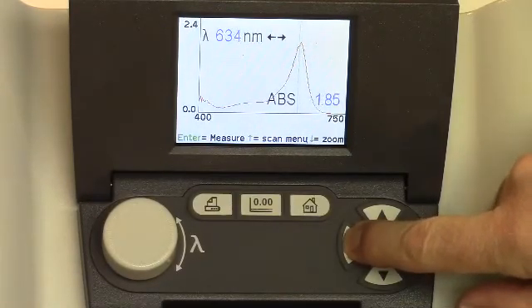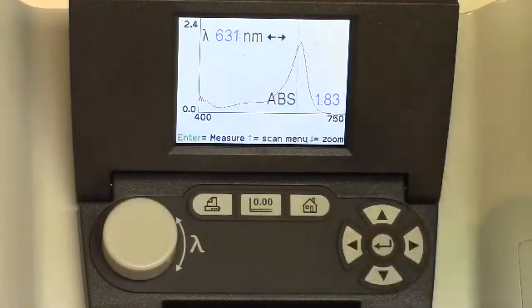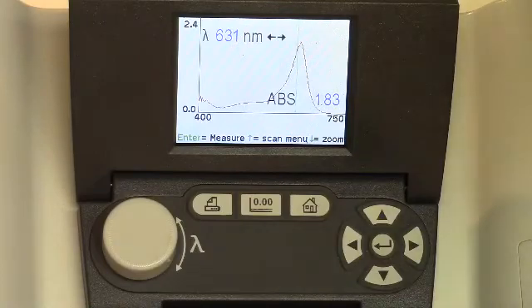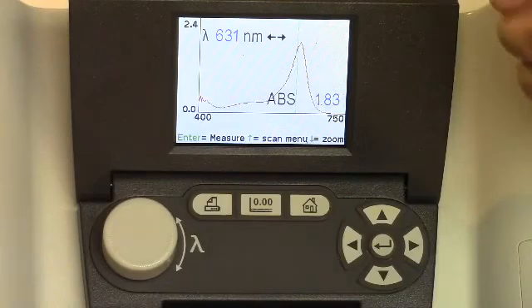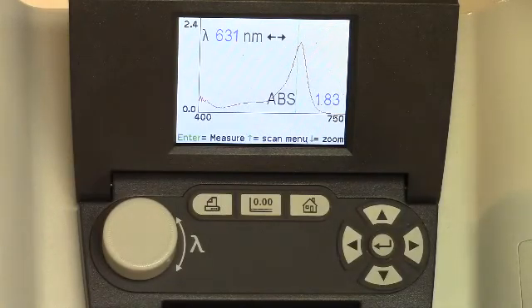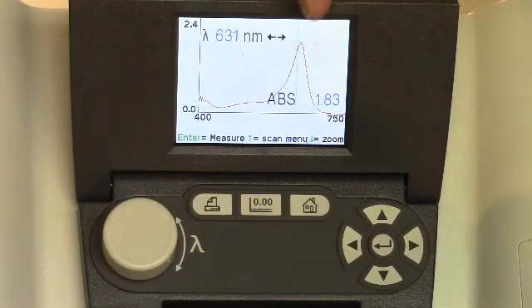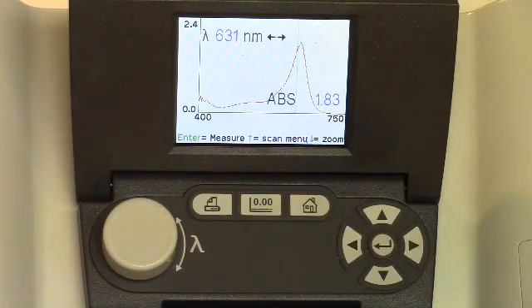So the reason we do this is we want to know where that biggest absorbance is. That's where this sample should be the most sensitive. And so we'll dial it in at that for the other parts of this experiment. We can also use that to help us identify if another sample has blue in it. We should see an absorbance right there. Even if it's mixed with other stuff, we're still going to see that absorbance from the blue color. Sometimes it could be masked with other things, but that's what we want to see there for the blue in that case.